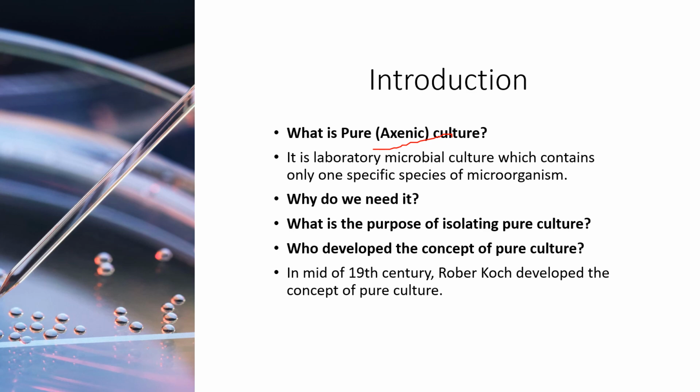They are always found as mixed culture where different species of microorganisms live together. By using different techniques, we can isolate the particular microorganism and culture them separately to obtain a pure culture. That's why pure culture is the most important technique for any microbiologist.